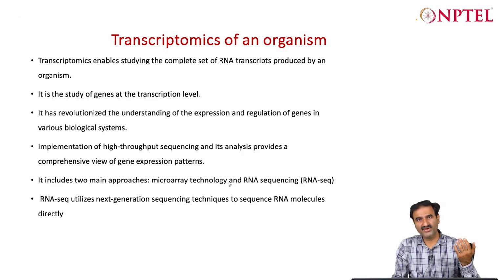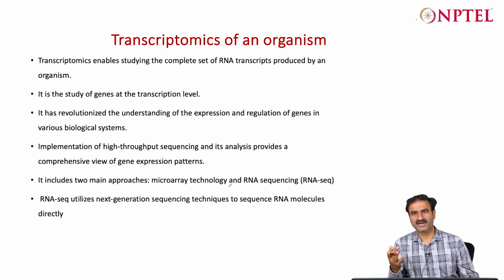But as soon as you get the leaves or this material, you should go ahead with extracting the transcriptome, the total RNA, because if you delay this, it will lead to automatic degradation of the RNA. So it should be done as early as possible. RNA transcriptomics tells you the number and type of transcripts, and also gives evidence for the presence of those genes in the genome, which helps as empirical evidence when you are running the MAKER or some other gene prediction pipeline, and also in the scaffolding process in the assembly.